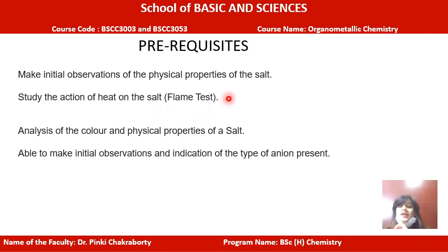Second is study of action of heat on the salt. That is also named as flame test. Now, this particular test is more helpful when you will be reading the PPT or the presentation based on cation analysis, because flame test mainly helps in cation analysis rather than in anion analysis.